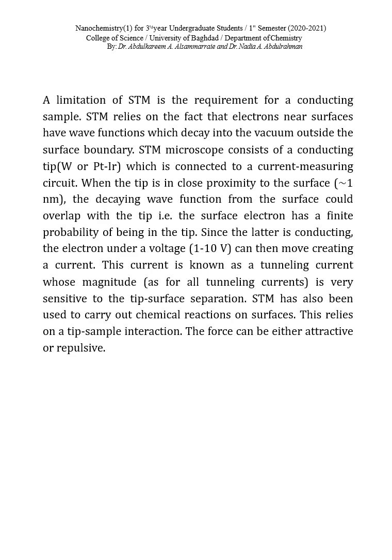This مو فقط قلنا للإيميجينج. STM has also been used to carry out chemical reactions on the surfaces. This relies on a tip-sample interaction. Again, الإيميجينج أو الchemical interaction, الatoms movement كلها تعتمد على الانتراكشن ما بين التip والسامبل. So this relies on a tip-sample interaction. The force can be either attractive or repulsive. طبعا اعتيادي من يكون تآثرات يا ما يكون تجاذب أو تنافر.